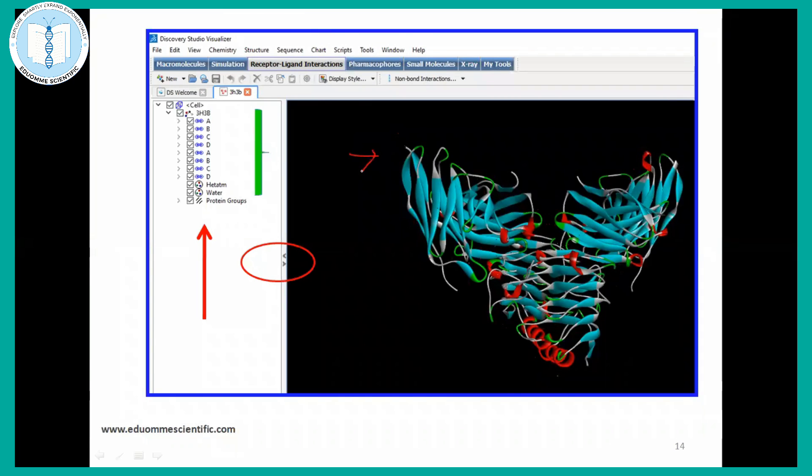Once your files are open, if you want to check the details about your protein molecule or other macromolecule, you just have to either click the control H or you can go to hierarchy and you can get the ideas about the chains. Here you can see A, B, C, D. There are four chains present in this protein molecule.